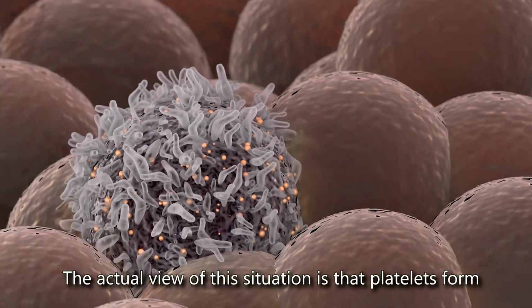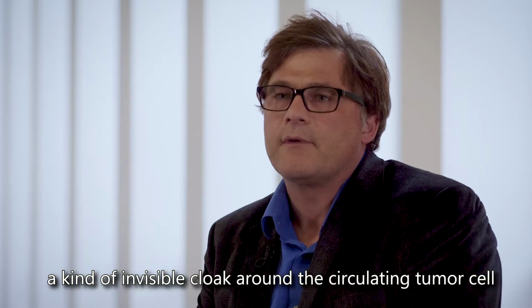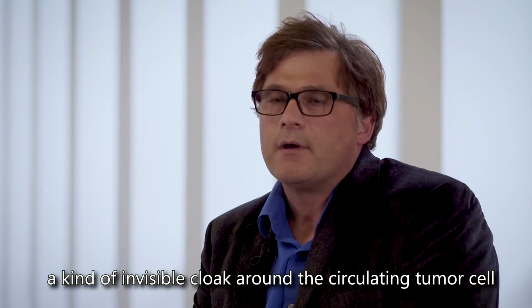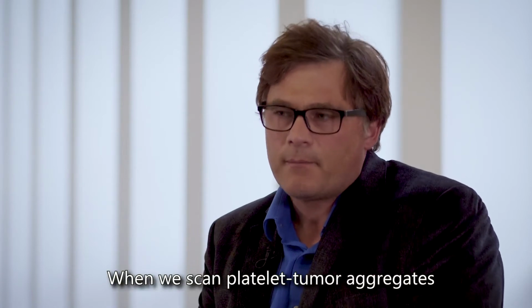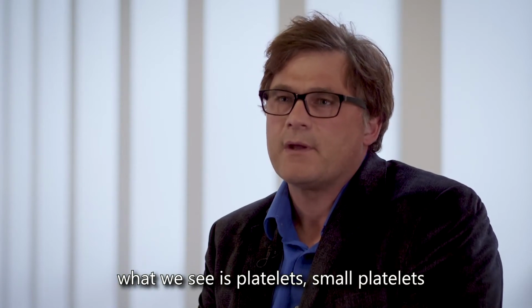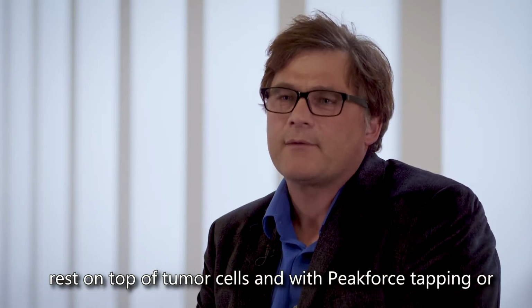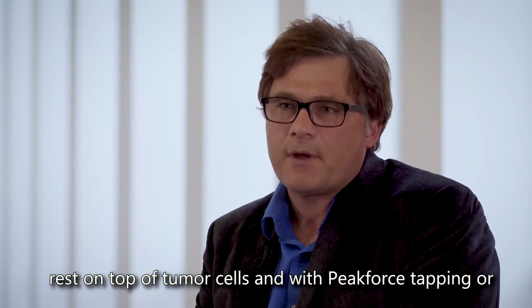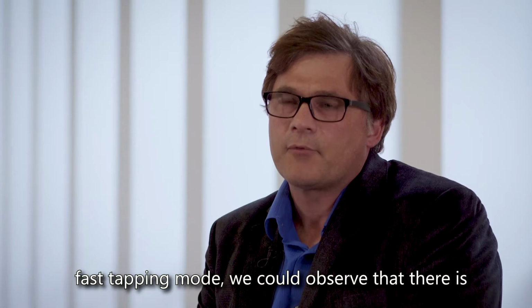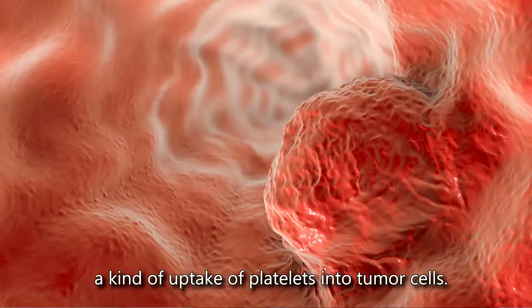The current view of the situation is that platelets form a kind of invisible cloak around the circulating tumor cell, but we never observe this. When we scan platelet-tumor cell aggregates, what we see is small platelets, or rests of small platelets, on top of tumor cells, and with peak force tapping or fast tapping mode, we could observe that there is a kind of uptake of platelets into tumor cells.